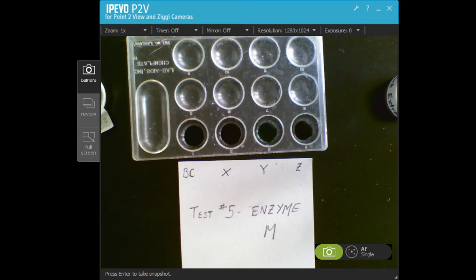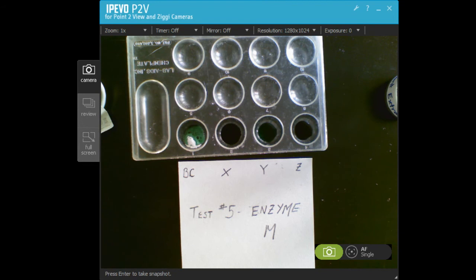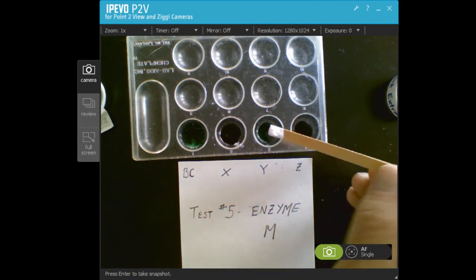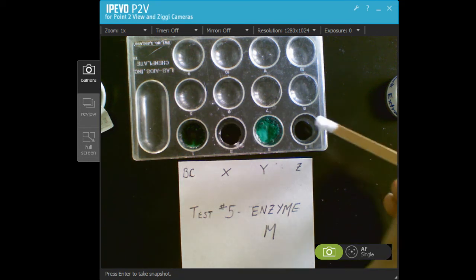If enzyme M is present there will be fizzing. So I'll put a small amount. You can see Botanicuris most definitely has enzyme M in it. X does not seem to have enzyme M. Species Y most definitely shows enzyme M.